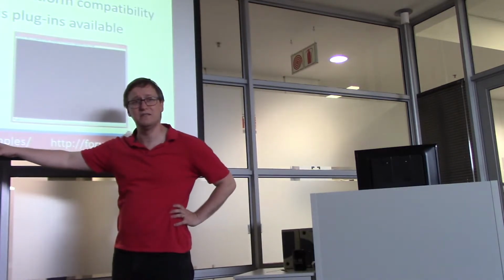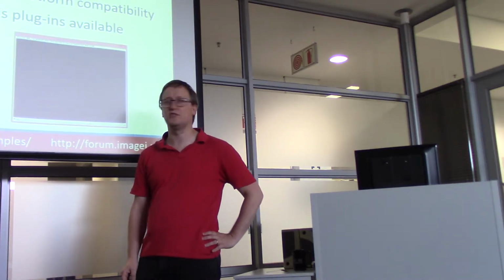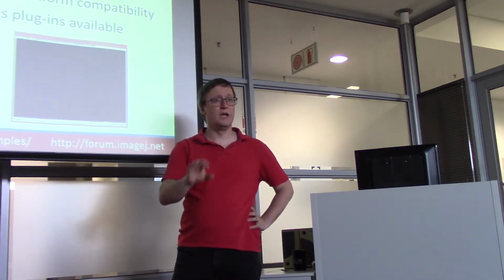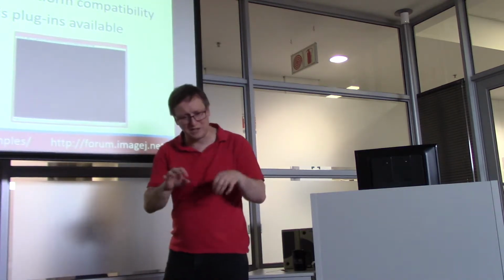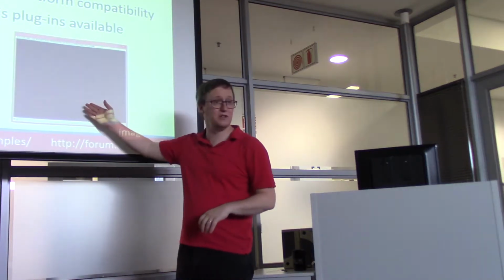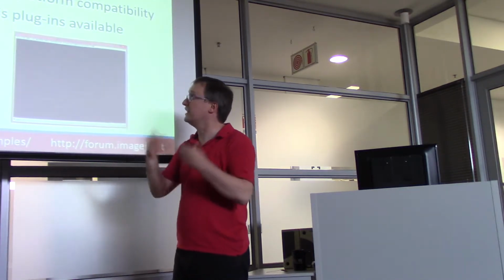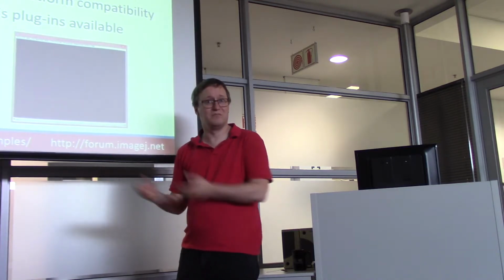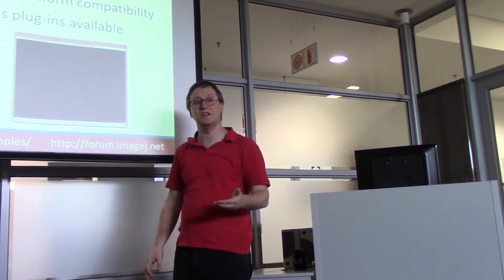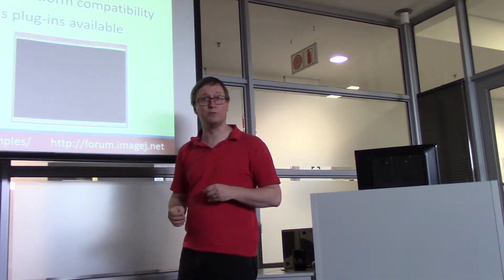Everyone heard of C. elegans? Okay, it's a worm that is very, very favored by the developmental biology community. So here we have a worm. If you are trying to evaluate the perimeter of this worm, you could sit there and lay a string on the print of the photograph and then figure out how long the string is, its circumference. Or you could just use a plugin within ImageJ for detecting the boundary of the worm and give you the linear measurement of its circumference for free. So that's a pretty good thing. There are a great many plugins available. So if ImageJ doesn't do what you want it to do out of the box, you can just download a plugin in many cases that will handle that task for you.